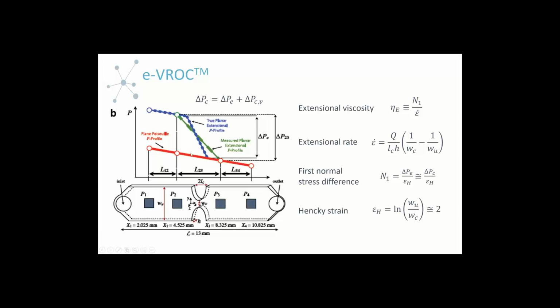We'll talk about it a little later when we get to using this flow channel on our Initium, where we have what we refer to as pre-run diagnostics. One of the tests to make sure everything was well for the uniform channel on our automated system is the R-squared value of this pressure drop across the channel. That's no longer going to be relevant, because that's not the nature of the pressure drop across the channel with our constriction.